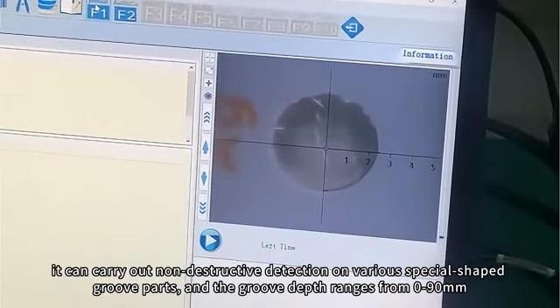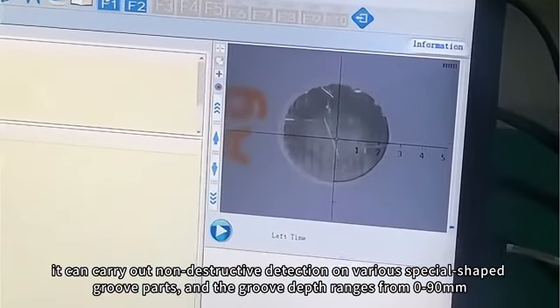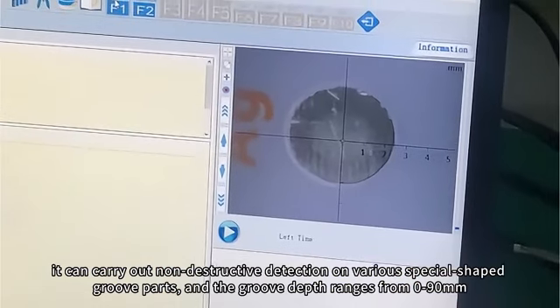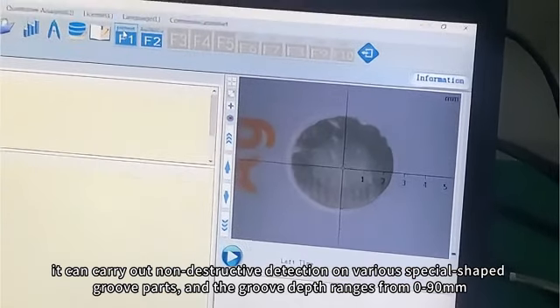It can carry out non-destructive detection on various special-shaped groove parts, and the groove depth ranges from 0 to 90 mm.